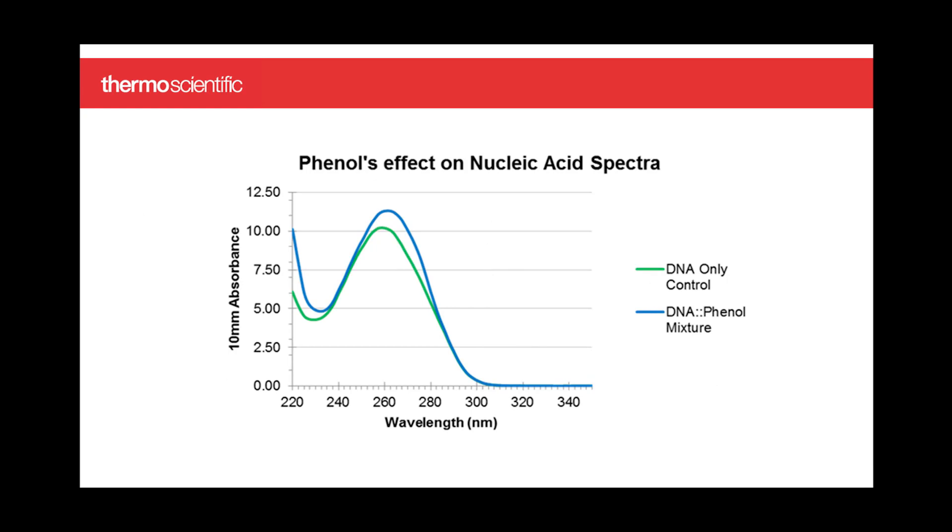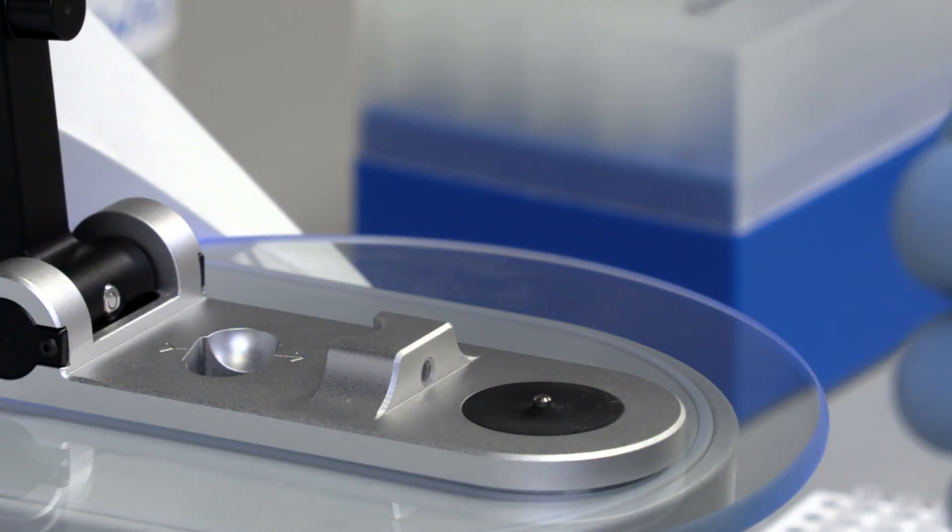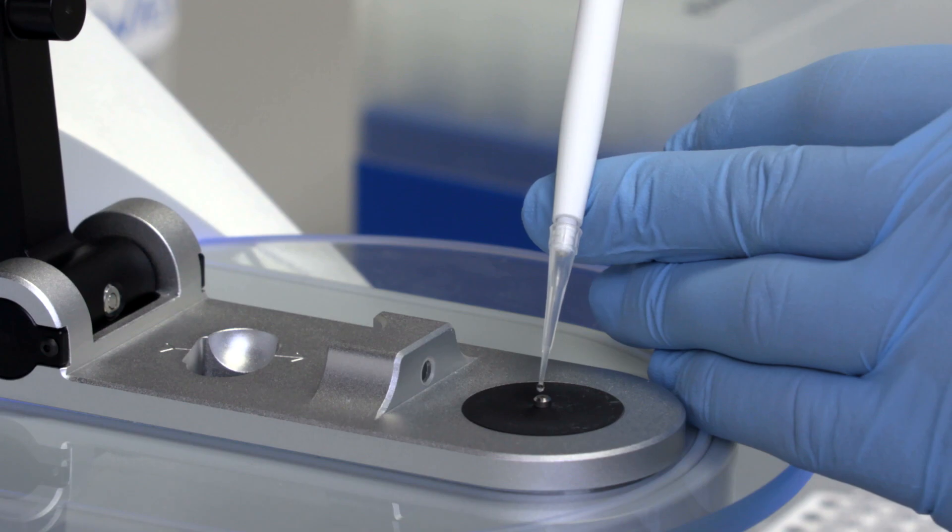The presence of phenol overestimates your nucleic acid concentration, which means you don't put enough template into the reaction. Guanidine salts inhibit polymerases and block the reaction. The Acclaro technology gives you information about your sample that no other software can.